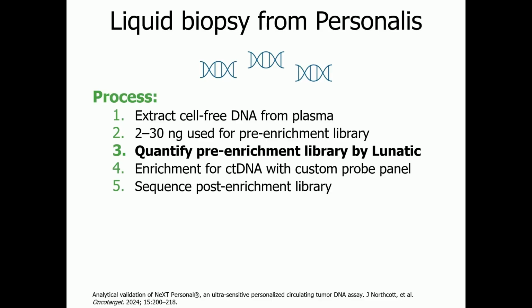The result from the analytical validation was that they were able to achieve 100% specificity in detecting ctDNA in the cfDNA of 123 patients. And this assay, this Next Personal assay, is actually currently being used and available for patients and researchers for detecting minimal residual disease, or MRD. And they published this entire analytical validation account in Oncotarget in 2024.